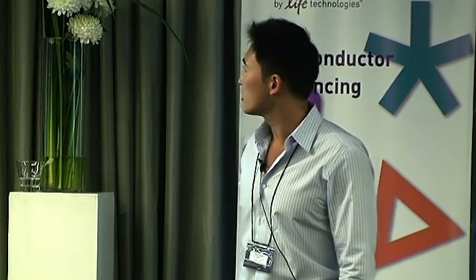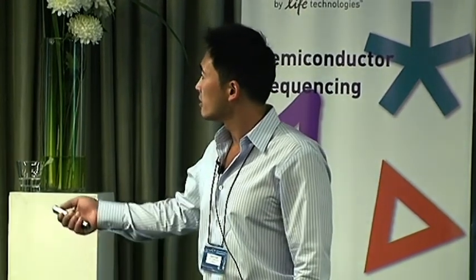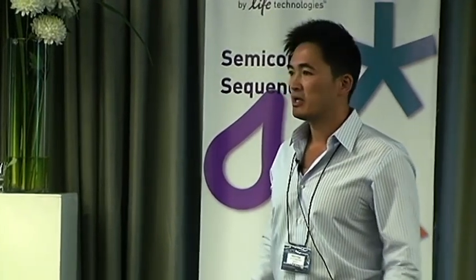So to start, I always like to start off a little bit with a TaqMan overview of the chemistry. Many of you are probably familiar with TaqMan chemistry and maybe the differences of that assay as opposed to a generic labeling approach. So I'll start off talking about TaqMan, and then a brief introduction into the OpenArray technology in general, and how it flows into this new QuantStudio system. And then I think the bulk of the talk, we'll talk about the machine in general.